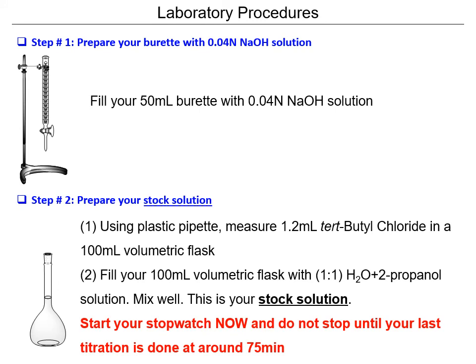So on this slide, you see the types of things you will need for titration. You have here what is known as a burette, which has numbers going down instead of up, as you would expect. You clamp it, of course, so it's hanging down, and then you release your liquid on the bottom. This is a volumetric flask. This has a very exact volume. Both of these are very accurate instruments for measuring volumes.